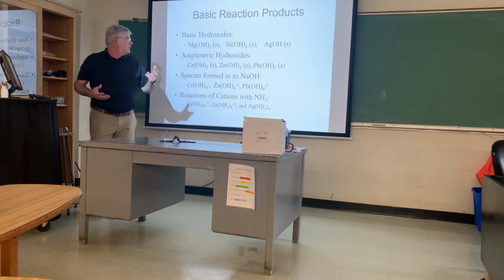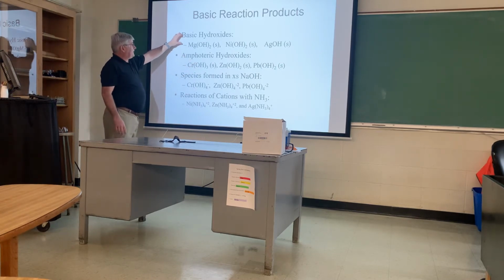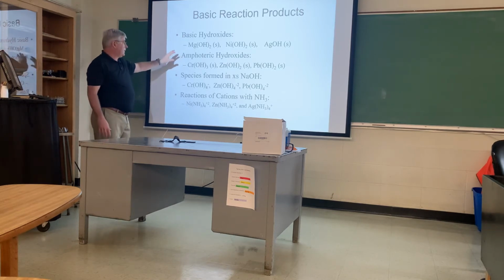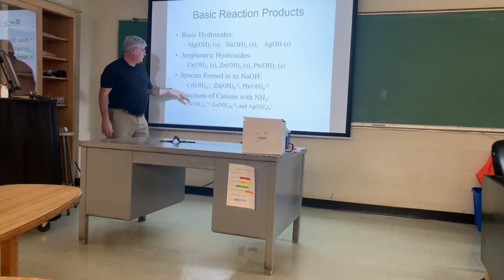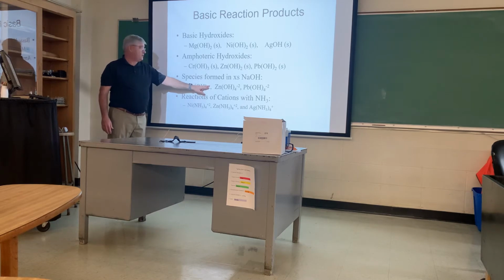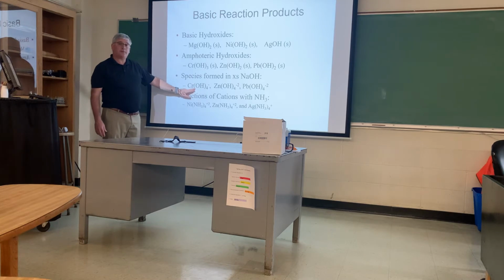Now, in fact, we say hydroxides are insoluble. But basic hydroxides, even if I add more sodium hydroxide, they remain the hydroxide, so they would remain solid. But the amphoteric hydroxides do something really cool. When I add the excess sodium hydroxide, what you notice is the chromium has 3 hydroxides, it adds a 4th. And when it does that, it becomes charged -1, and so the chromium hydroxide solid redissolves and disappears, okay? And it goes back into solution.